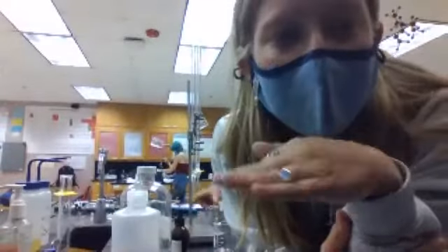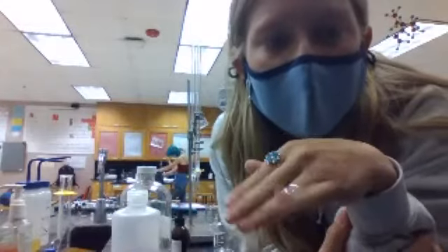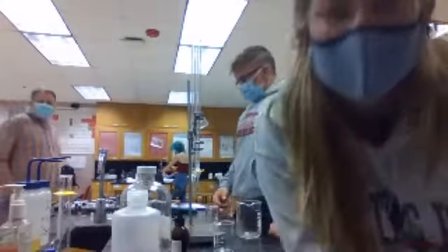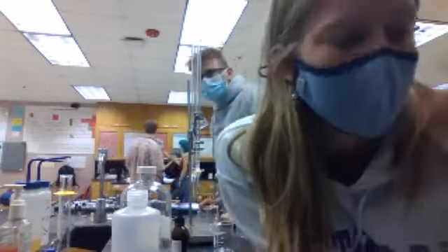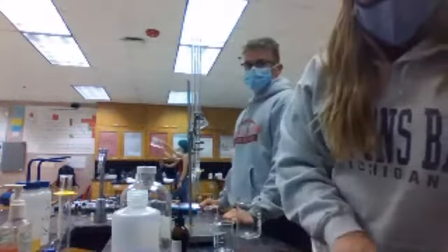Alrighty, everyone. I'm feeling more prepared today, so hopefully this goes smoother. Someone get the graph out, because that's the most important thing for trial number 3. We're going to take the pH every time we put 1 milliliter of base into the liquid. But first, we're going to take 10 milliliters of the acid and find the pH of that and do the inverse log again. FYI. Okay.